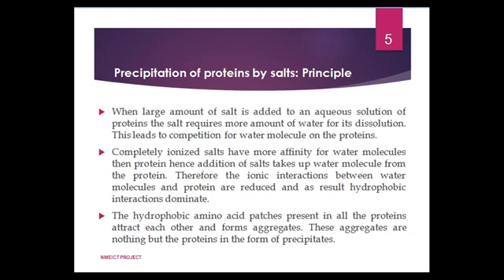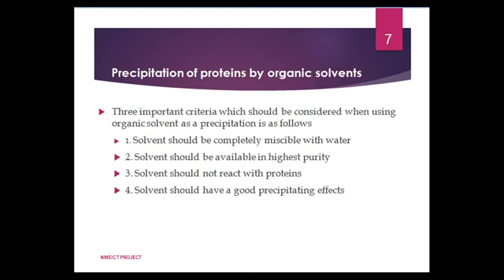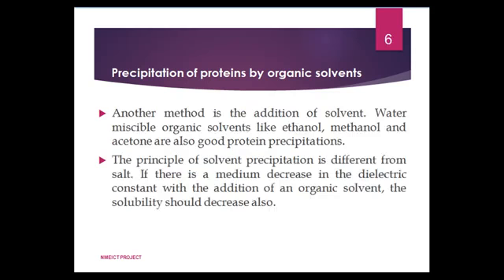highly soluble proteins. There is another method of precipitating protein. Precipitation of proteins by organic solvents. Another method is the addition of solvent. Water-miscible organic solvents like ethanol, methanol, and acetone are good protein precipitants.